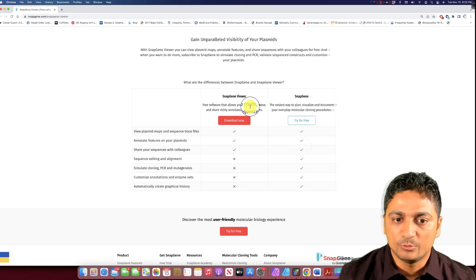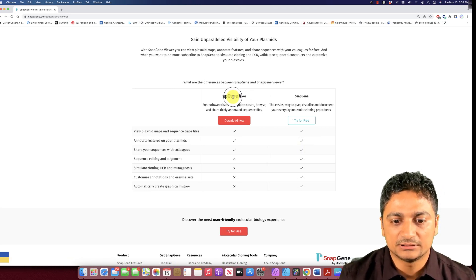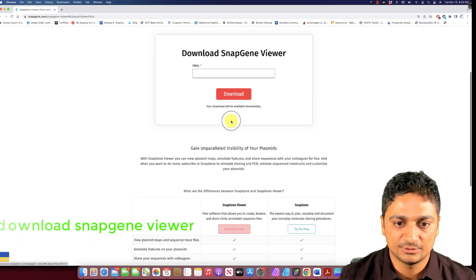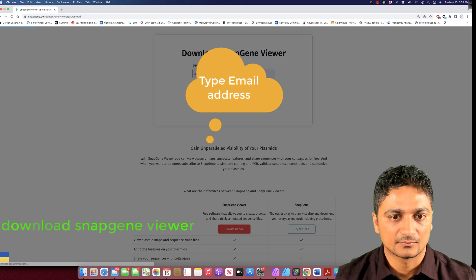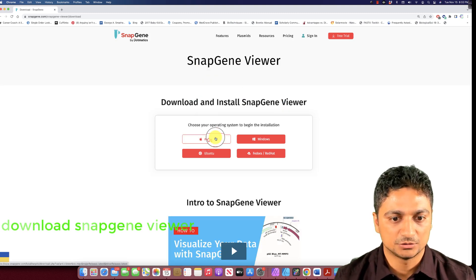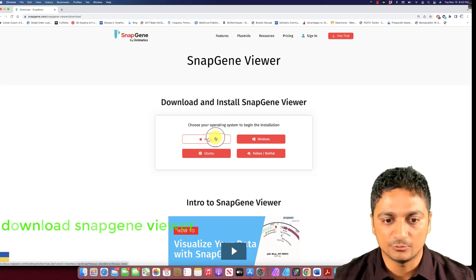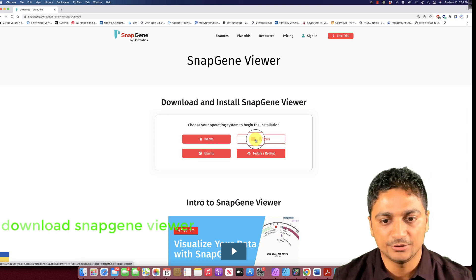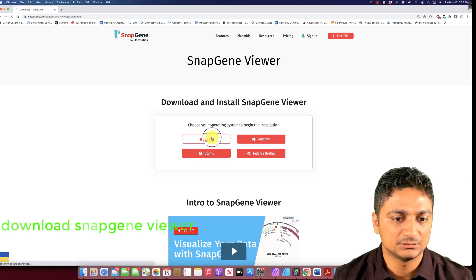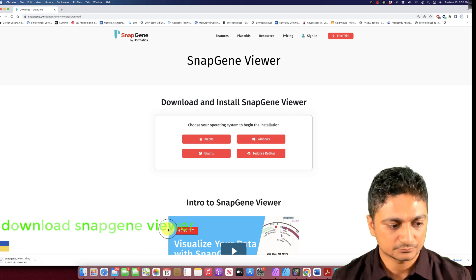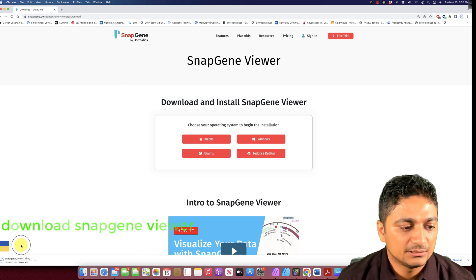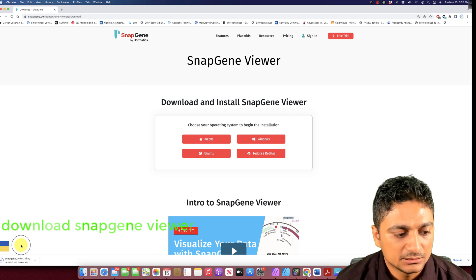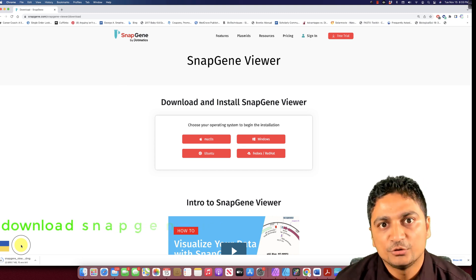For this demonstration purpose we just need SnapGene Viewer, so let's go ahead and download it. I'll provide the email address and download. I'm working on Mac so I'm going to download the Mac version. If you are working on Ubuntu or Windows, you can download the similar version. The file is 60.7 megabytes.